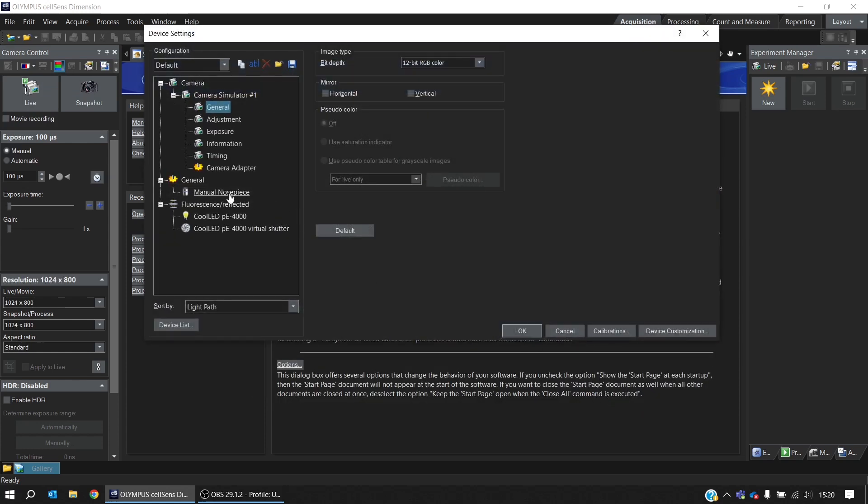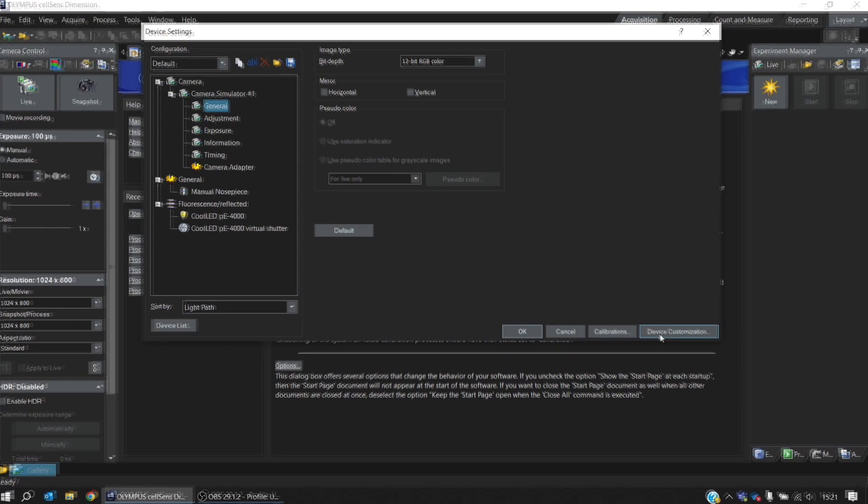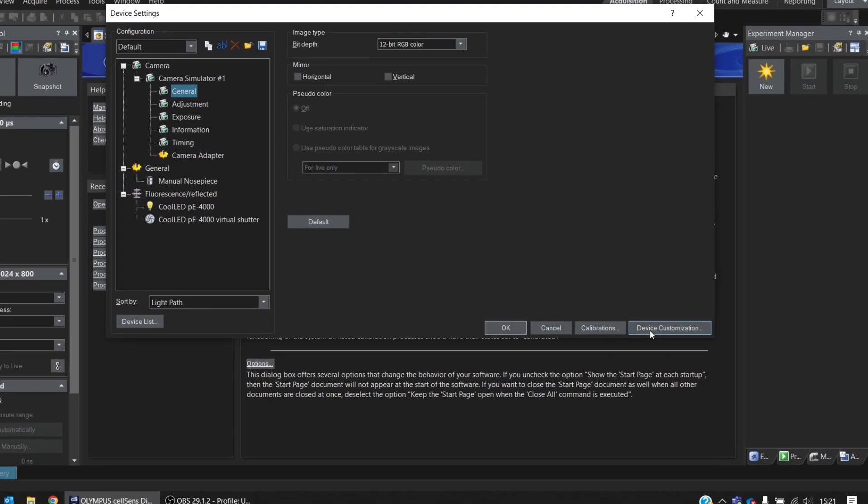And here we can confirm that the PE4000 has correctly installed. So now it's time to look at Device Customization.